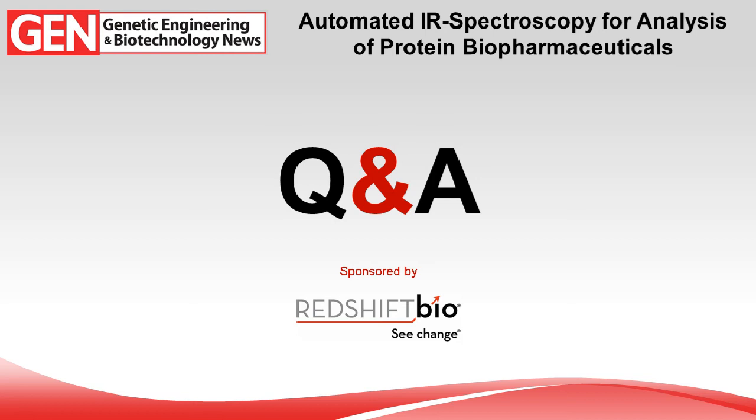Yes, that's a very good question. The MMS technique's key feature, compared to FTIR, is that FTIR measurements typically take about 1-minute intervals. So there can be slight shifts in peak positions and variation in peak intensity.